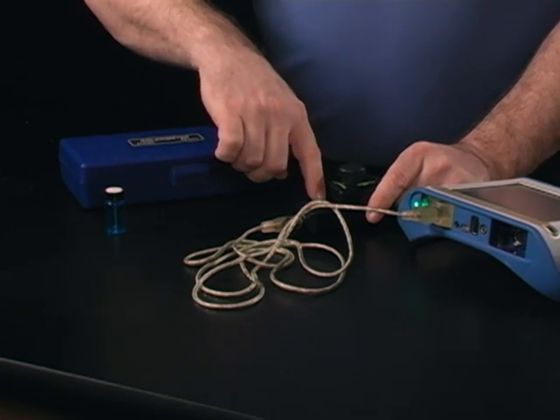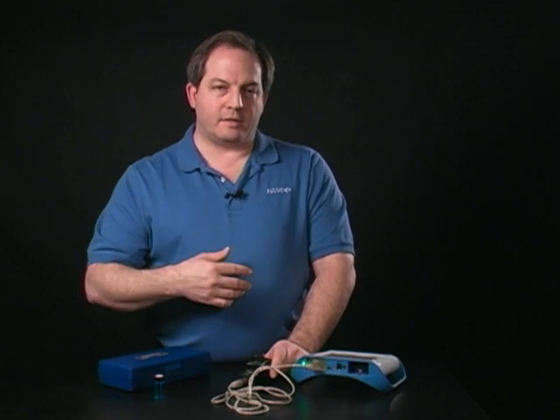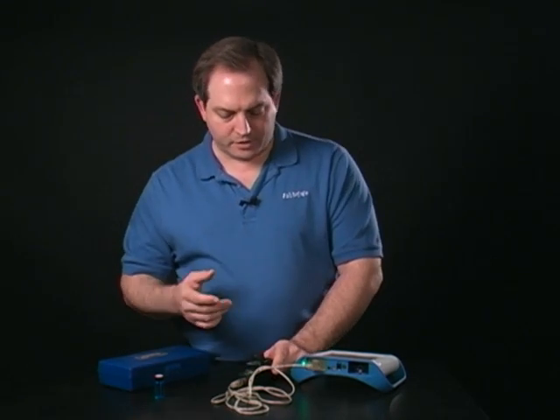I'm going to go to the front here and I have a button for calibrating. I'm going to press that button and the button light will come on to let me know that it is in its calibration routine.